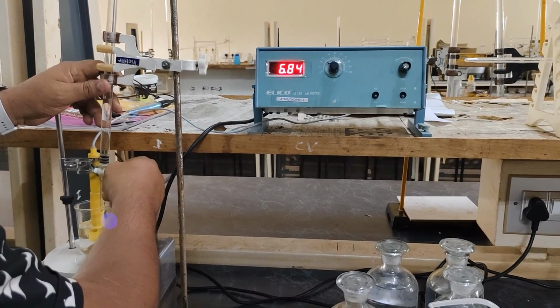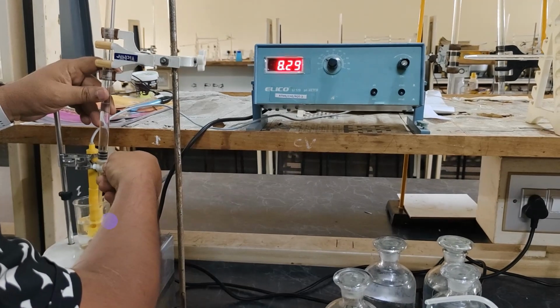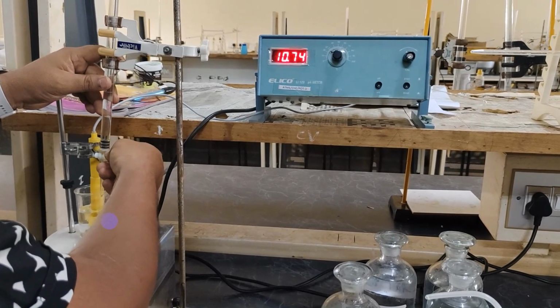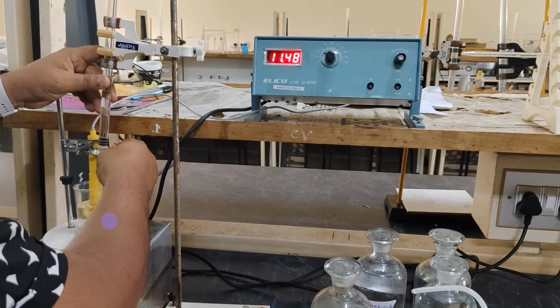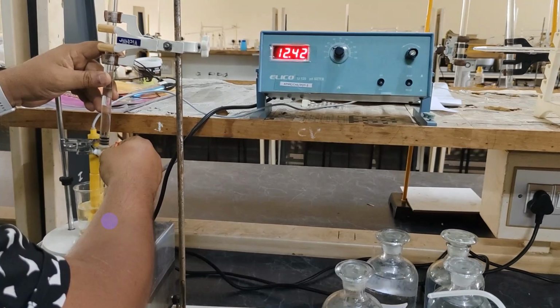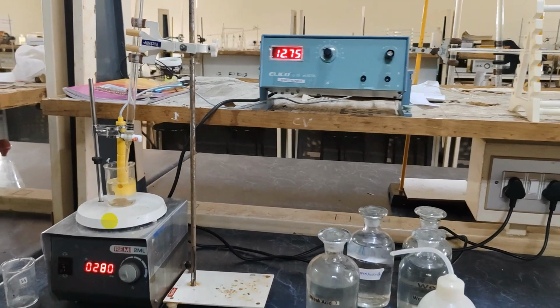The further addition has taken the pH to 9.3. So continue this addition of sodium hydroxide with increments of 0.5 ml until the pH reaches 12. Later on, add 2 or 3 more trials. So already it has reached 12. So this will be sufficient. Once you reach the pH of 12, you can stop the titration.